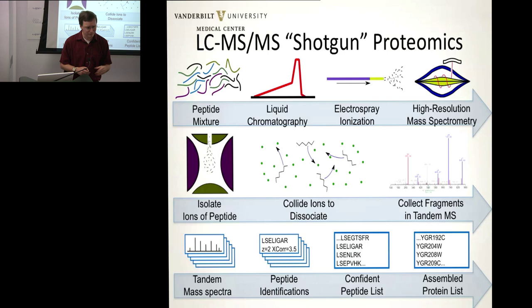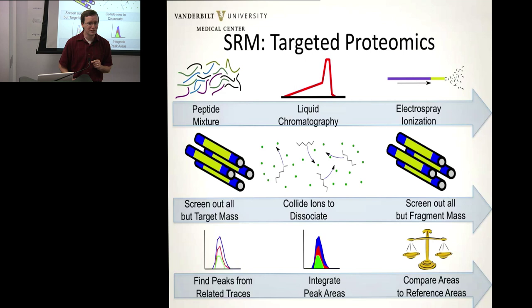Let's go ahead and move forward. Now, I've learned recently that you've just picked up a second kind of mass spectrometer here, the Waters Xevo. Oh, thank you. That's very helpful.